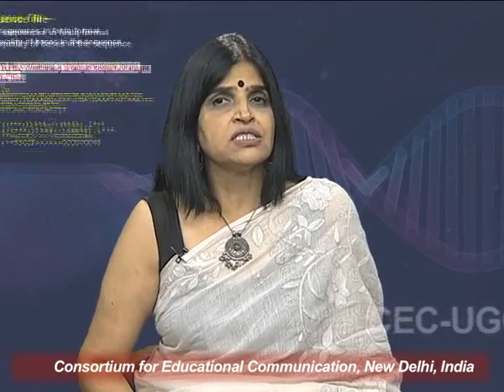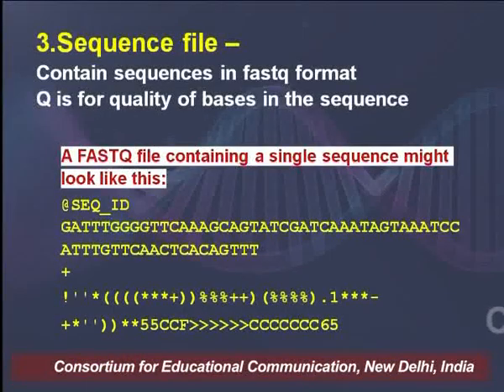The third type of file which we have here is the sequence file, which contains the sequences in FASTQ format. FASTA everybody is very familiar with by now, and the Q means that these sequences also tell you about the quality of the bases in the sequence. Because we have huge data, huge variability, and it's environmental data, good information about the quality of the bases is also important.